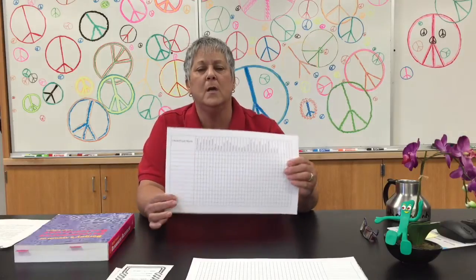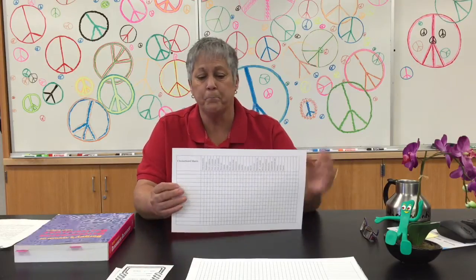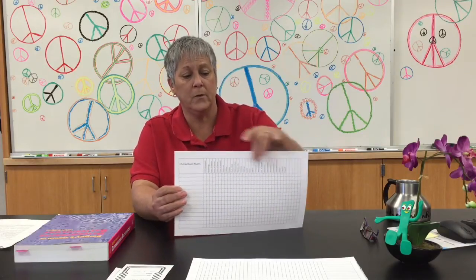Okay, so you've got this checkerboard matrix. You're going to be taking that down to the library. You've already written all of the organisms' names that were on your bug list here, and then you've got the names of the tests up above.